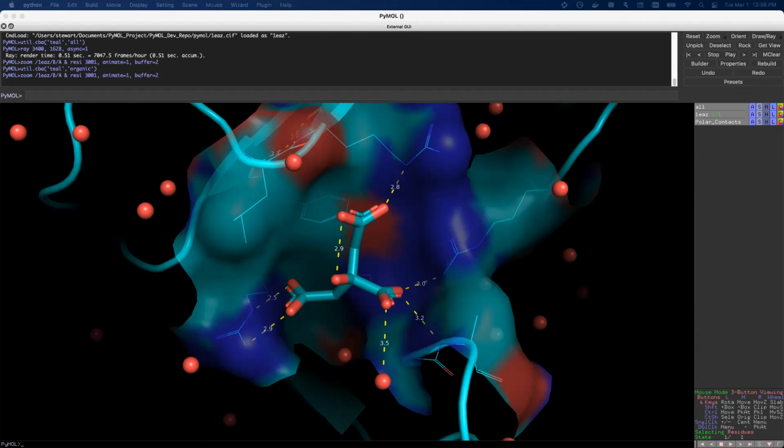But I feel like I keep saying that, this highlights yet another case of being very, I don't want to say niche, but department dependent. So within your department, you might want to have a, hey, this is how we load in crystal files initially when we're going to be discussing the crystallization results or something like that.